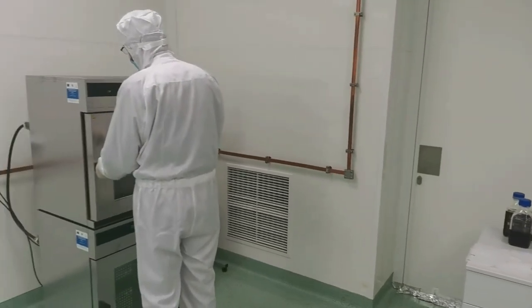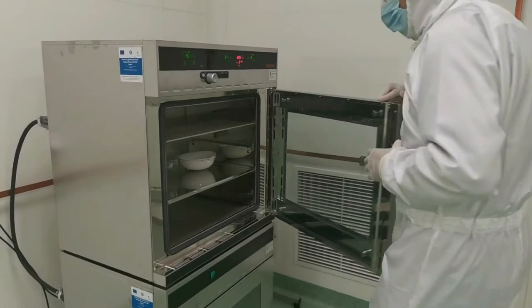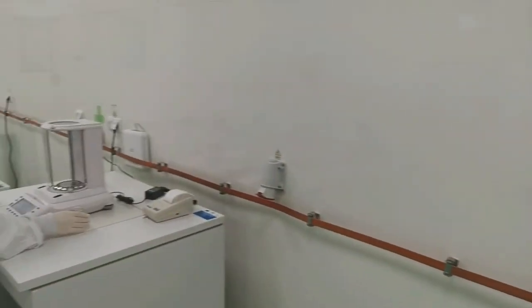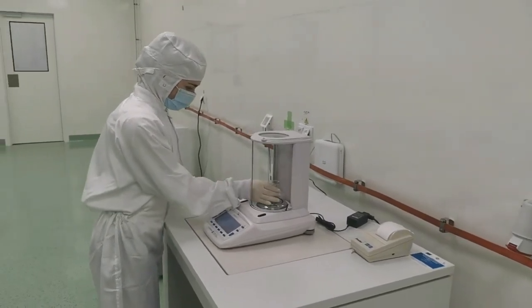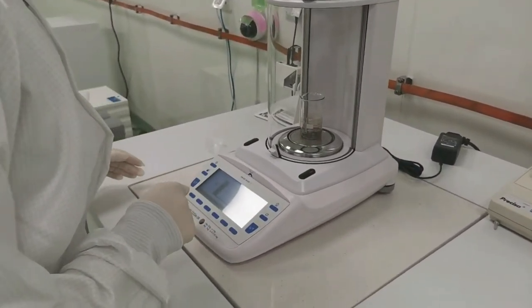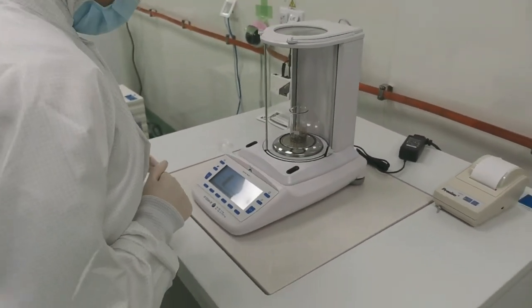The vacuum drying stove is mainly used in the drying process of the glassware. Other chemistry laboratory accessories are also available: analytical balance, pH meter, stirring plates, and an electrochemical station for nanowire synthesis with power supply, electrochemical cell, digital multimeter, and so on.